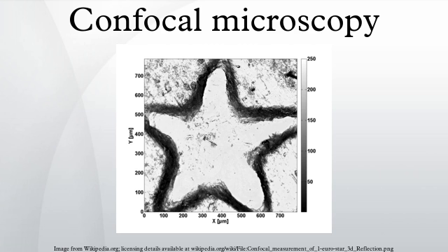The point spread function of the pinhole is an ellipsoid, several times as long as it is wide. This limits the axial resolution of the microscope. One technique of overcoming this is 4Pi microscopy, where incident and/or emitted light are allowed to interfere from both above and below the sample to reduce the volume of the ellipsoid. An alternative technique is confocal theta microscopy. In this technique, the cone of illuminating light and detected light are at an angle to each other. The intersection of the 2-point spread functions gives a much smaller effective sample volume. From this evolved the single-plane illumination microscope.